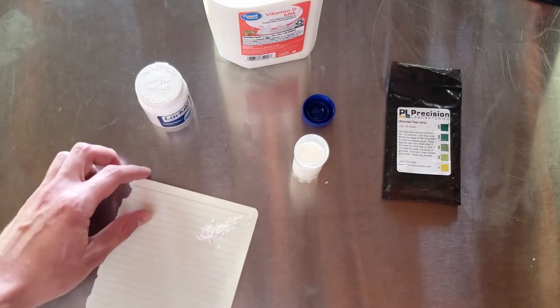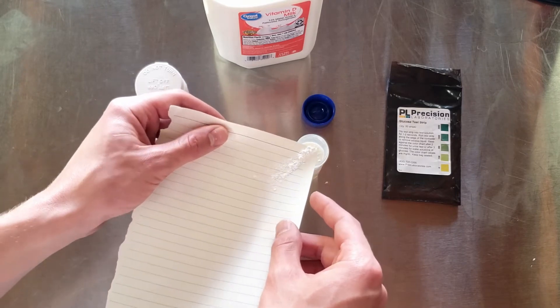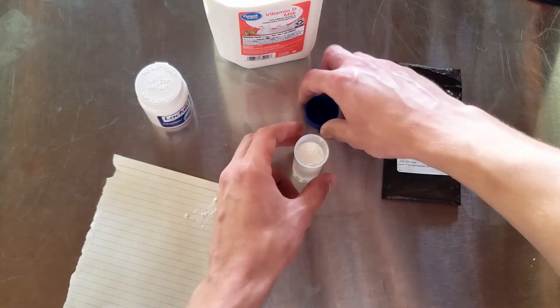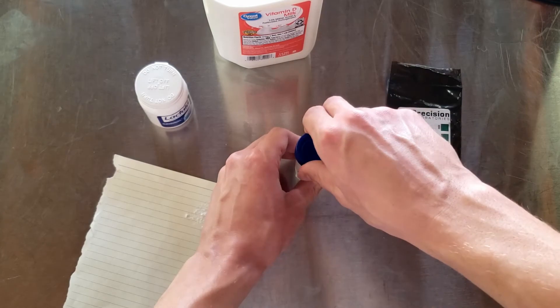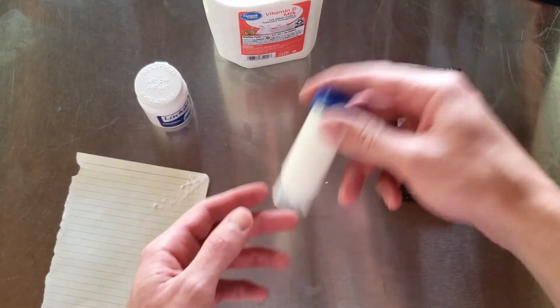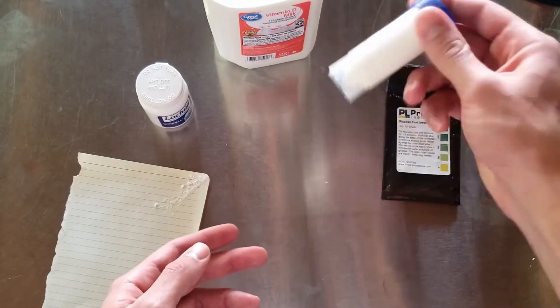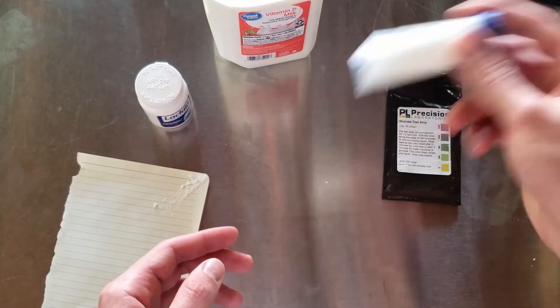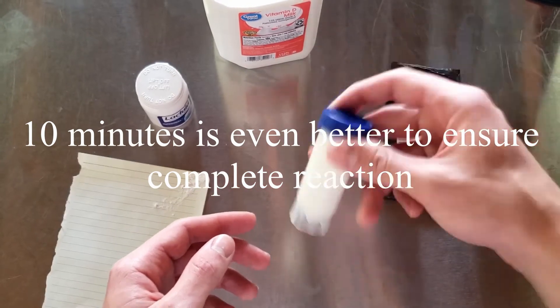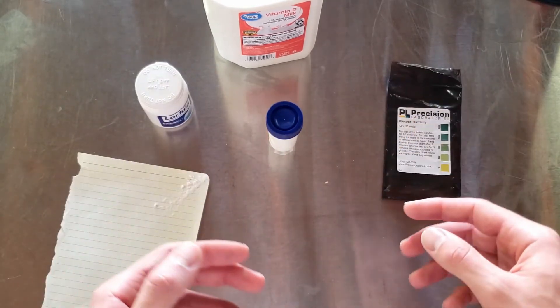So we have the product we want to test, and we're going to add some of this lactase enzyme. You really only need maybe a third or a half of a pill per about a cup of product that you're testing. This enzyme is pretty active, but if you use more, it's not going to be an issue. I'm shaking it here just to mix the enzyme around. I'll note that this milk is cold right now, so the reaction is going to happen a bit slower, but even with cold milk the reaction can occur within five minutes — and five minutes is plenty of time to measure the glucose. I'm going to start a timer now, wait five minutes, shake it every now and then so everything's evenly mixed, and then we'll measure the glucose.